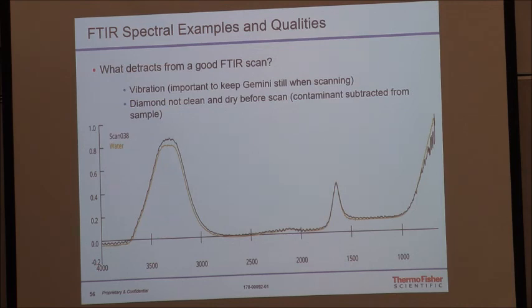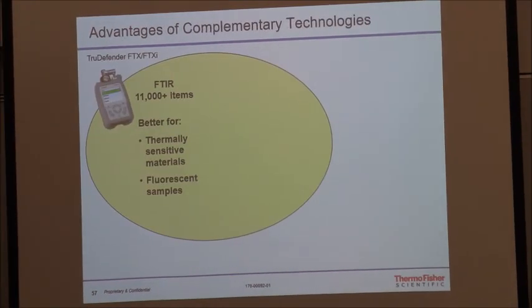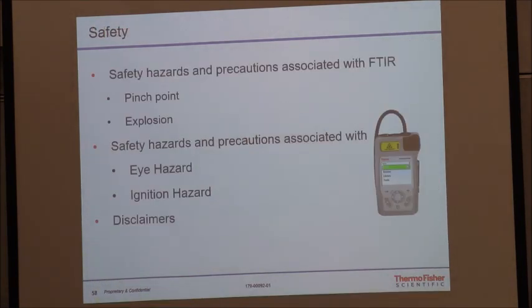But if you suspect it based on intel, run your KI paper, run your peroxide papers and stuff, and start running other stuff. Even if you ran this on an FT and it came back and said you have water and hydrogen peroxide, to me that's still one technology. I would want you to run other stuff. Okay, run your oxidizer papers, your peroxides, run a Raman or something like that. Just know that the Raman won't see the water. Okay. All right. So what? Oh, shoot. I screwed that slide up, didn't I?